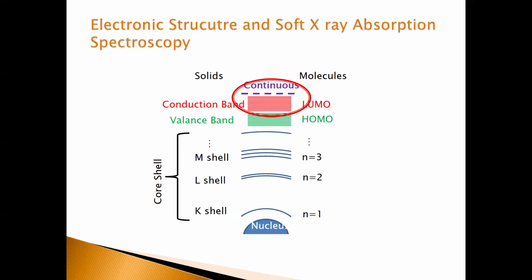Thank you for your presentation. I want to know if this technique can be used to determine elements in two different oxidation states. For example, when you are working on redox processes, an element in one state is in +2, and then you add a reagent, it changes to the +4 oxidation state. Can we use this technique to do such studies?